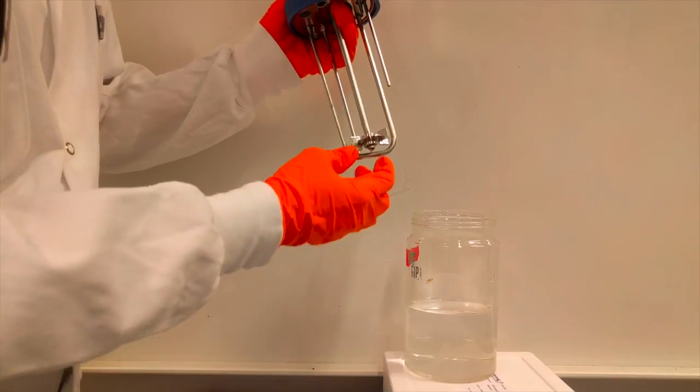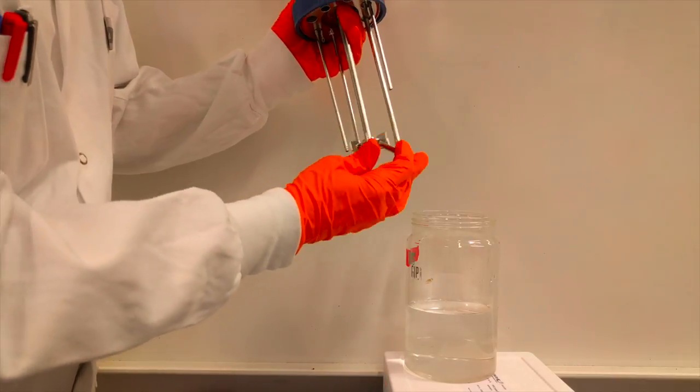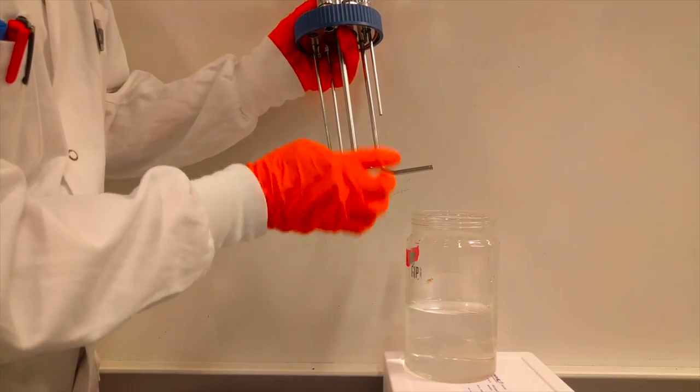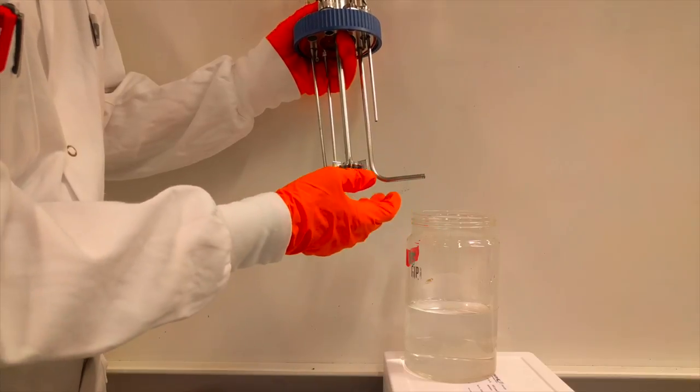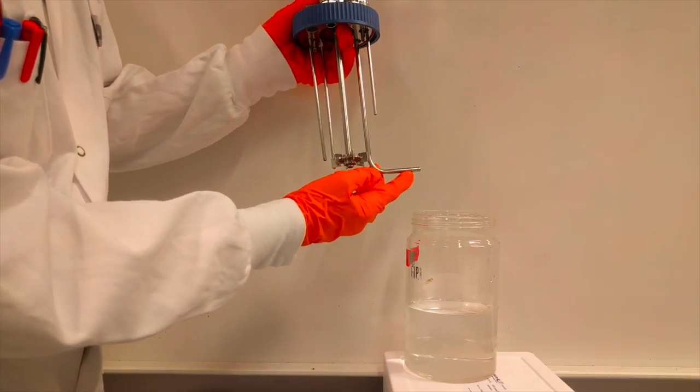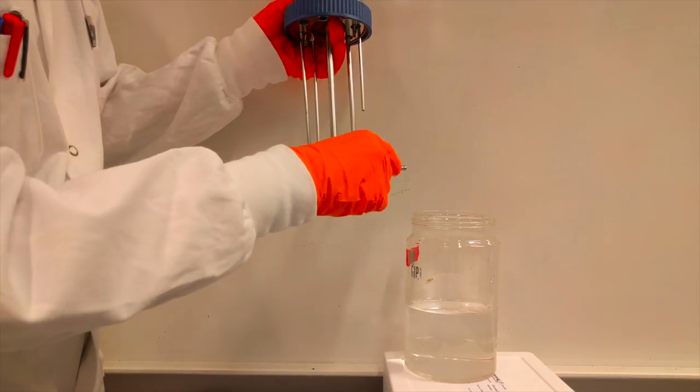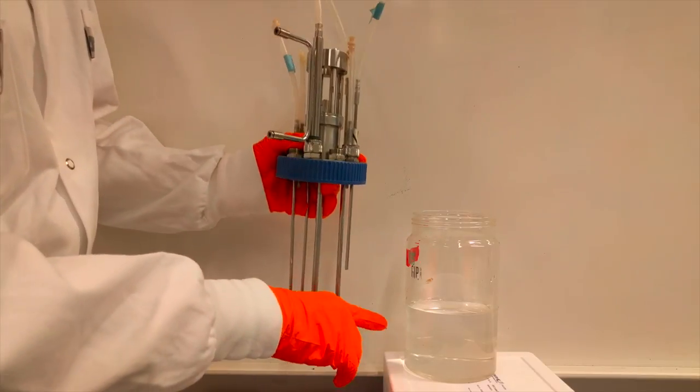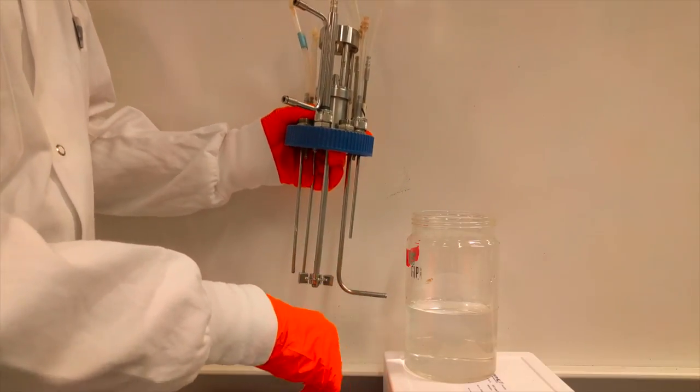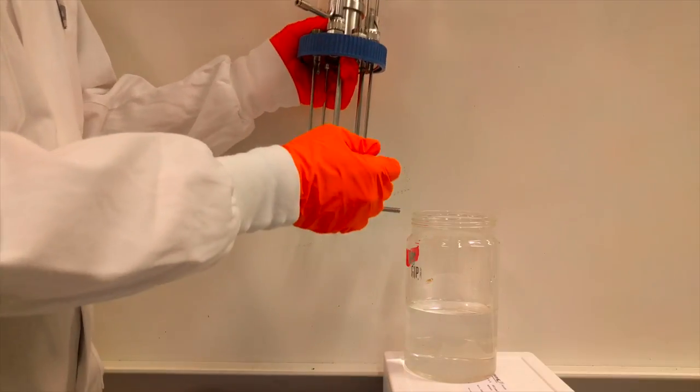So we have stirring. The next thing is to look at aeration. Aeration is going to be accomplished via sending air down through this - this is called the sparger. At the bottom of this, there are air holes which are going to allow air to be pushed out toward the bottom of the vessel.